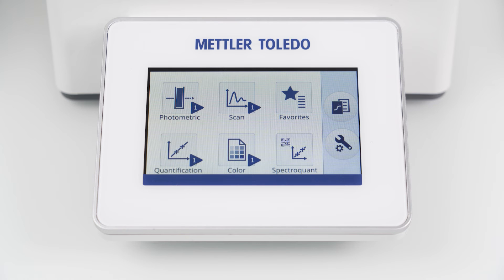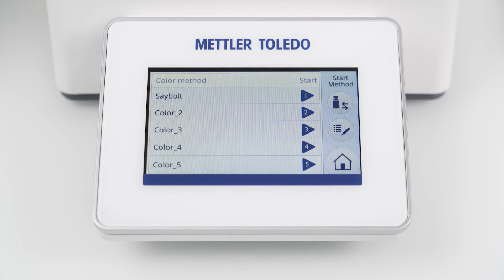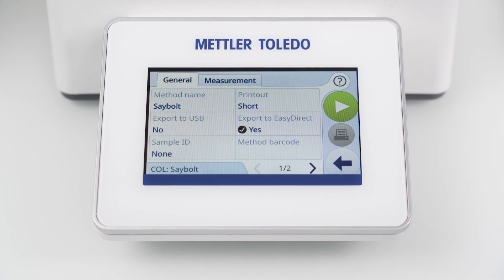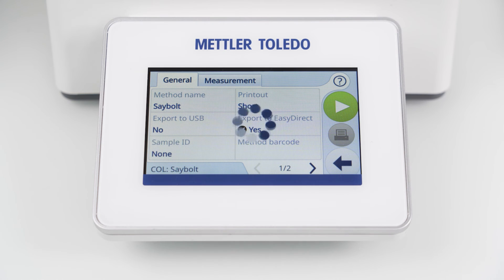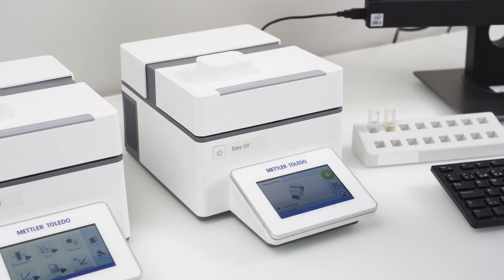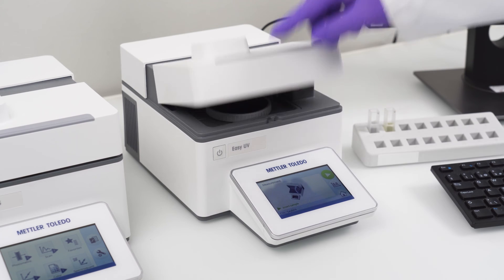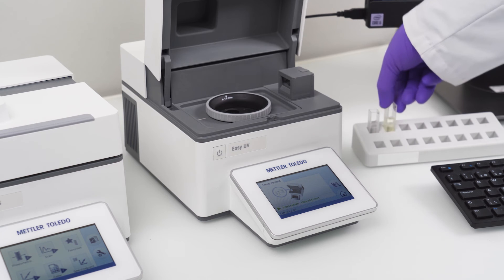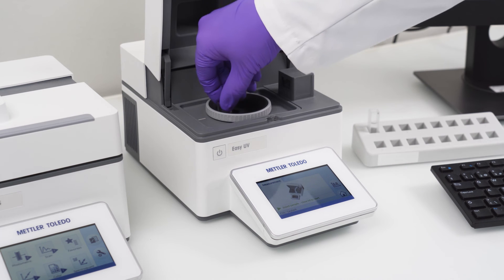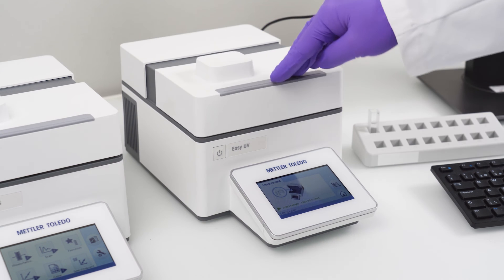If you are regularly measuring color samples according to different color scales the EasyDirect UV-VIS software can save you precious time as it can show multiple color results out of a single measurement. Let me quickly demonstrate this to you. I have here a yellowish sample from which I want to determine the color according to the Saybolt and ASTM color scale.